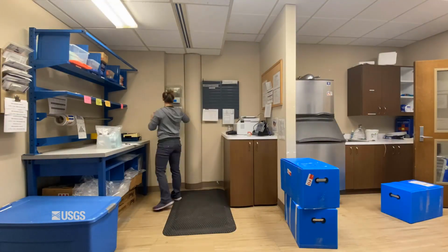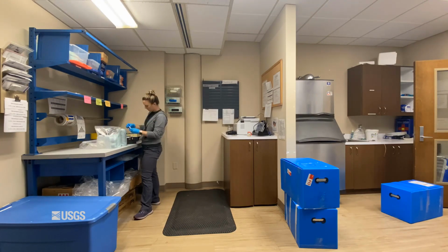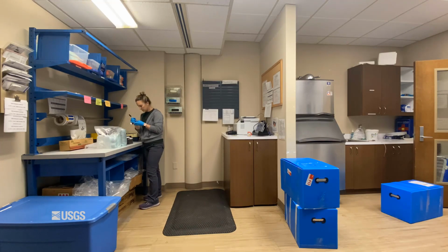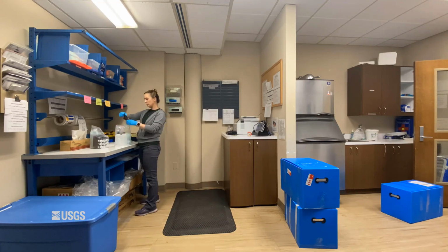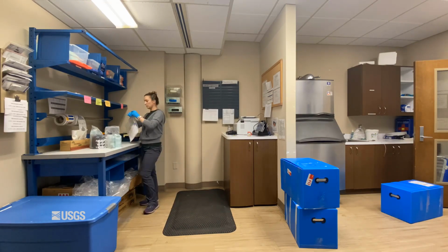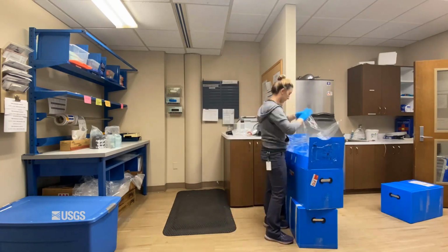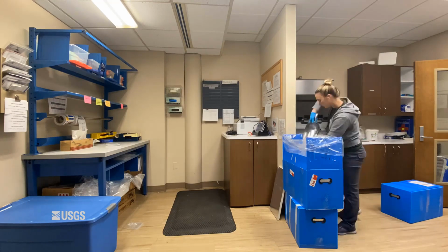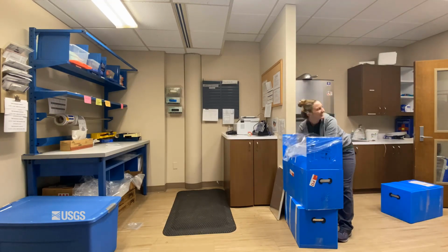We are just about wrapped up with our water quality sampling. The next task is getting our samples to the lab for analysis. Here's a time-lapse of the shipping process. The goal is to ship out samples quickly and securely. Each bottle and its respective paperwork is checked for accuracy of identifying information. Caps are secure and fragile bottles are appropriately cushioned. They are then tucked in ice, bagged, taped up, and on their way to the lab.